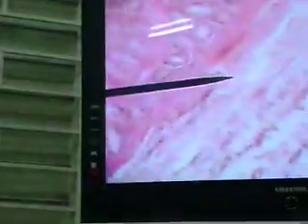Now remember, let's go back to the basics. So we're up here in the rectum. Remember, however, this is an animal, so not conforming really to what we fully expect. But the outer longitudinal layer, the inner circular layer should be thickening.